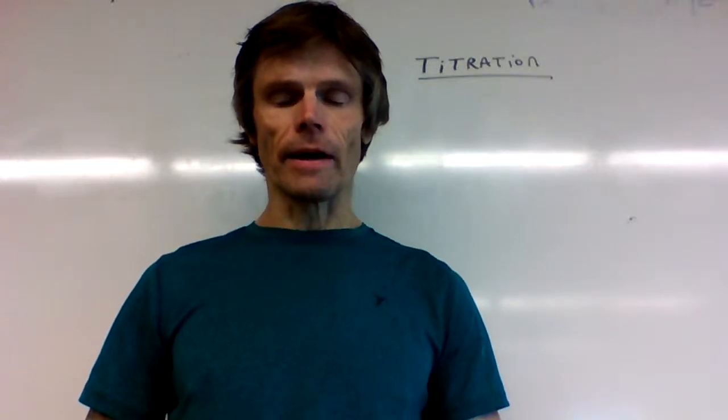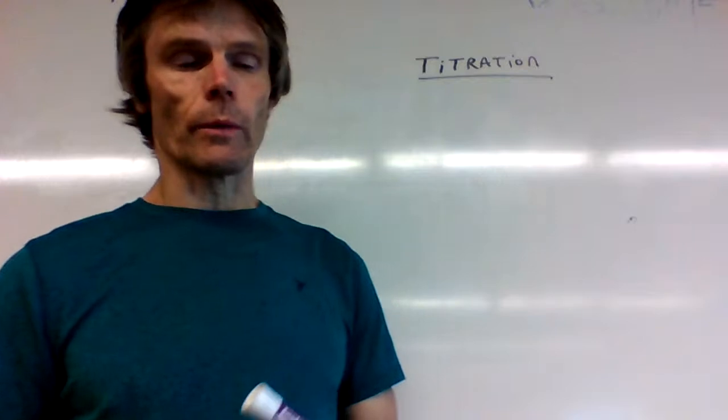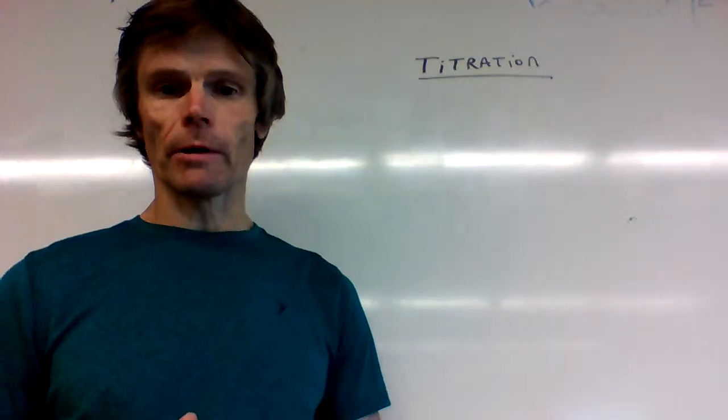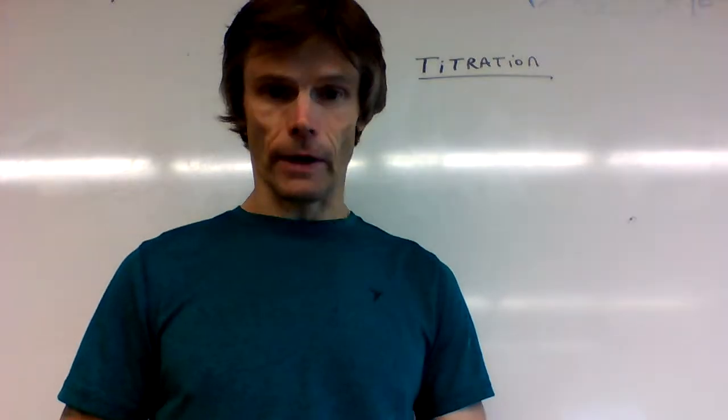Hey, Chem 1110, it's Dr. Patton. We're getting close to the end of the semester, and today our experiment is going to involve titration.